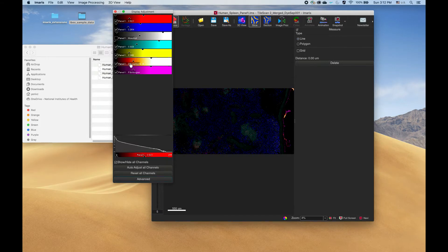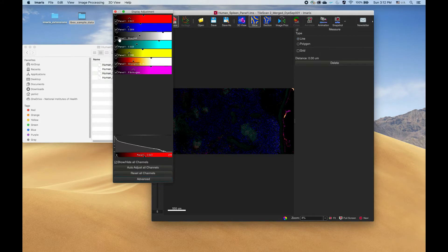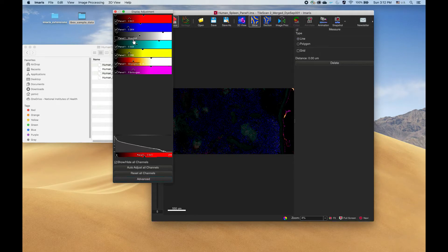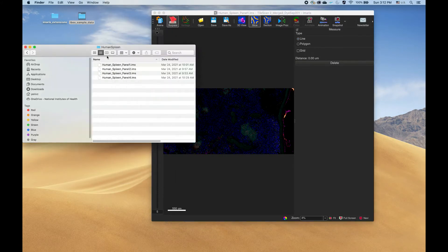Now, I don't actually want all of them to be called exactly the same name. Our scheme is that the channels have a prefix, separator character, in this case colon, and a postfix. In this case, it's called panel one colon Hoechst, and that will identify that as a registration channel for us.